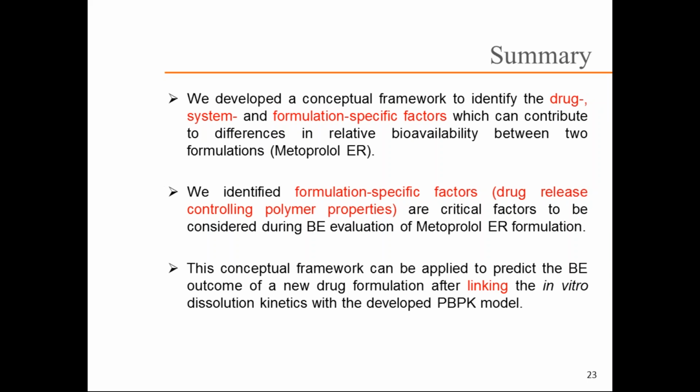Second, we can identify that formulation specific factors are critical factors which should be considered during the evaluation of a metoprolol ER formulation, which also supports the fact that the established IVIVC of metoprolol is formulation specific, which was done by numerical deconvolution. So whenever we are doing a different formulation, we have to look critically at how it might perform when we are using the in vitro dissolution input.